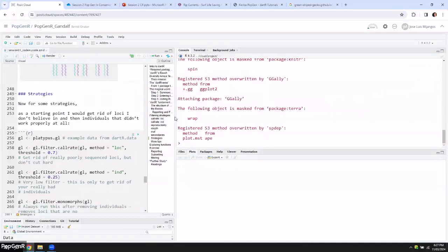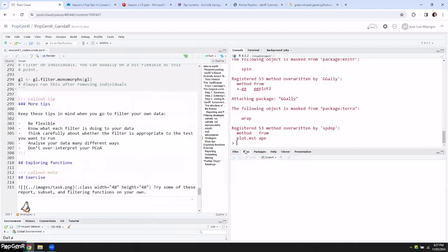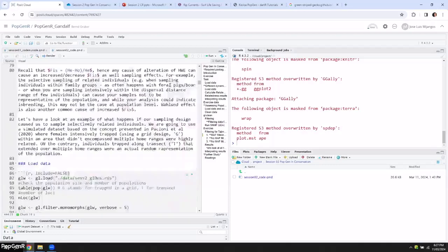There are various ways to deal with it that have their own outcomes. It is possible, if you're running from raw data, to merge your FASTQ files. It actually is super, super easy to do that, but then you have very different coverage for your individuals. So I don't know exactly what Dart-R does with the reproducibility data or the reproduced individuals in terms of SNP calling. Andrew, are you able to answer that?